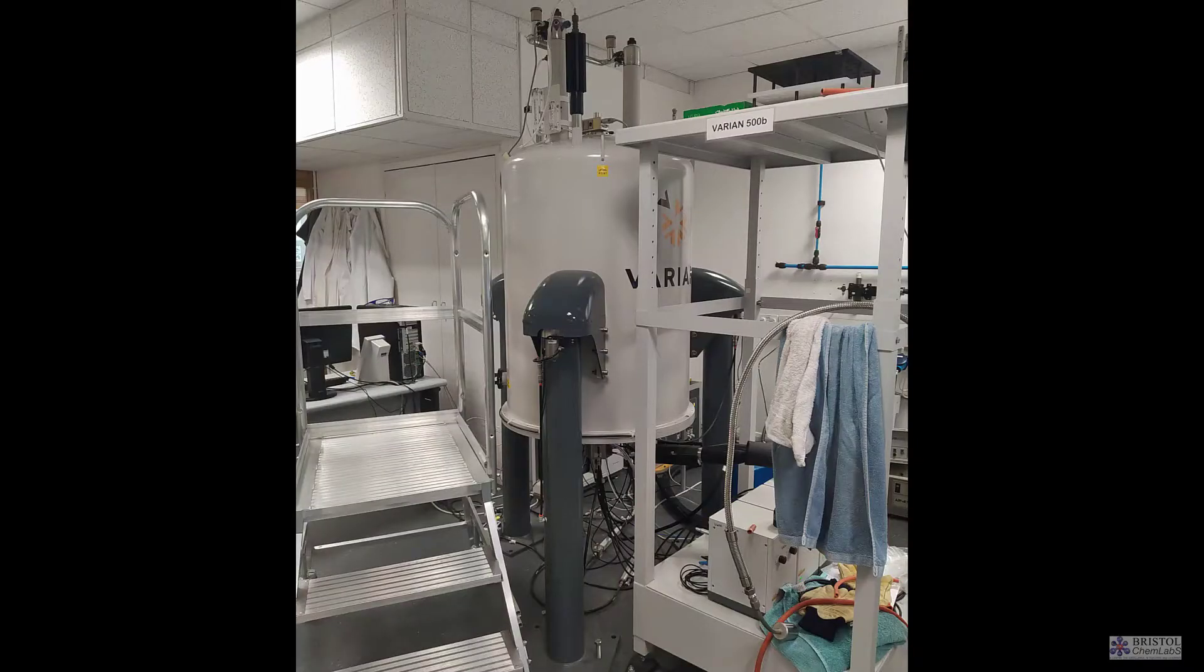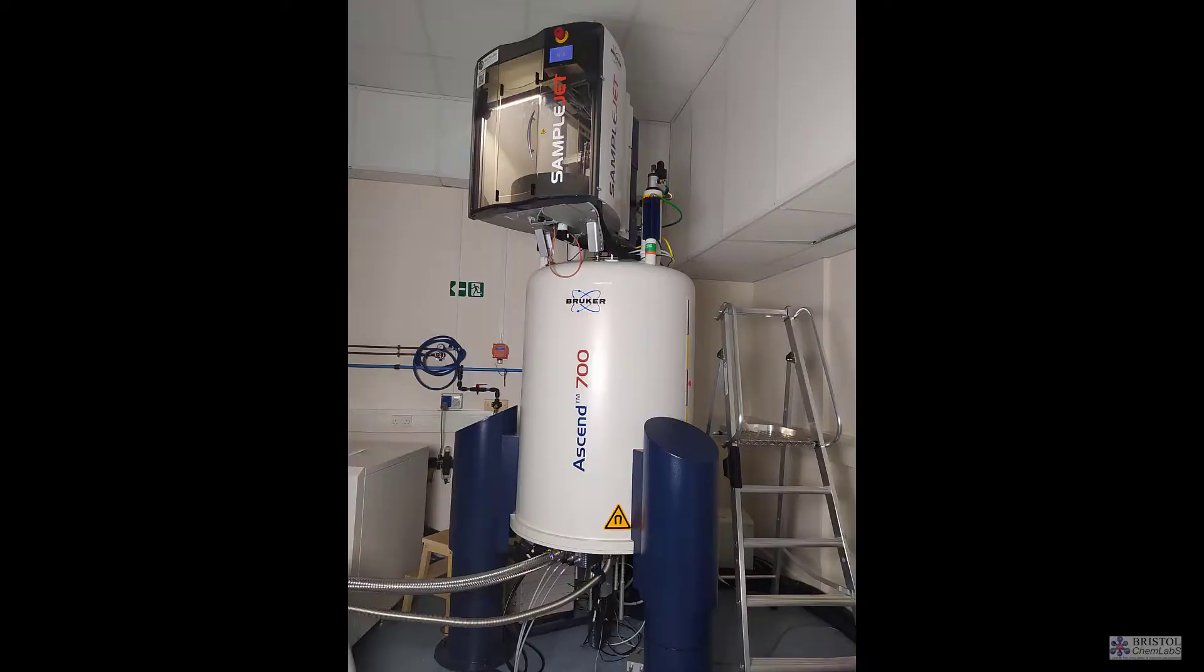We have a range of different NMR spectrometers here in Bristol, from small, what we call 300 megahertz NMR spectrometers, up to very large 700 megahertz NMR. The biggest NMR spectrometer in the world at the moment is a 1 gigahertz spectrometer in France. As you go to larger magnetic fields, they become more expensive, but they give you a lot more capabilities.